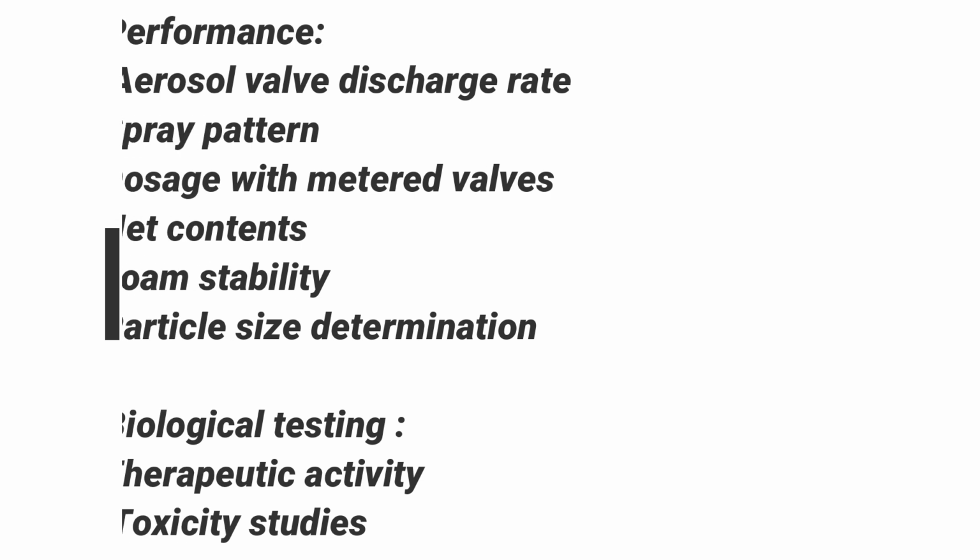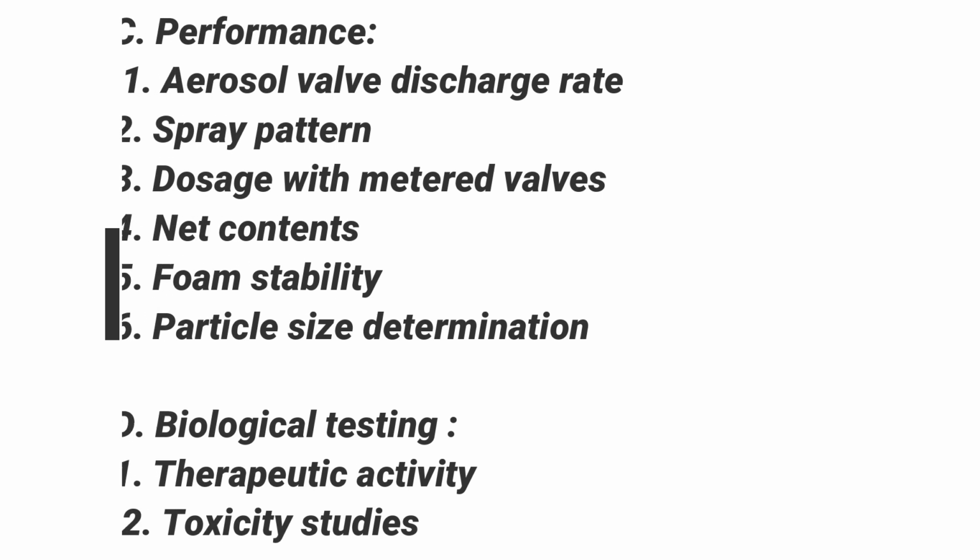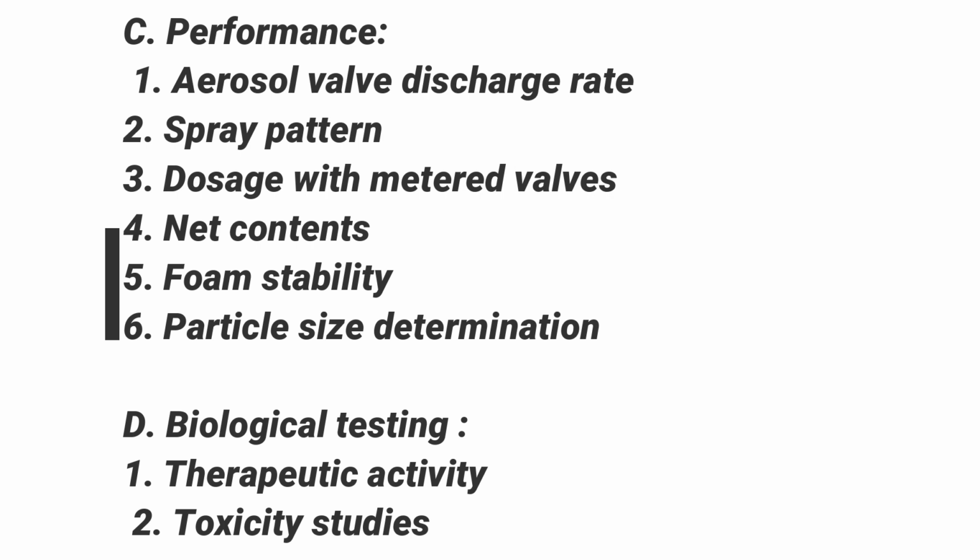So coming to the next one, performance. In performance, we will check aerosol valve discharge rate. Here, the contents of an aerosol product of known weight are discharged for a specific period of time. By reweighing the container after the time limit, the change in weight per time dispensed gives the discharge rate, that is gram per second.